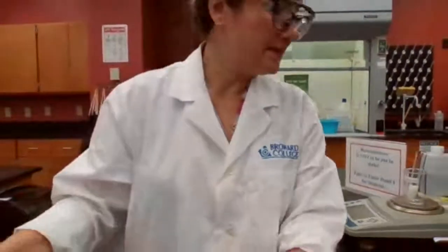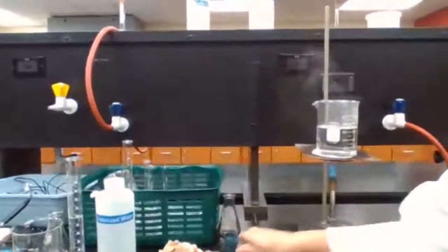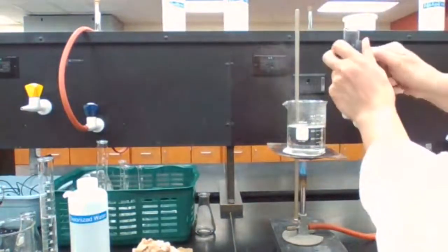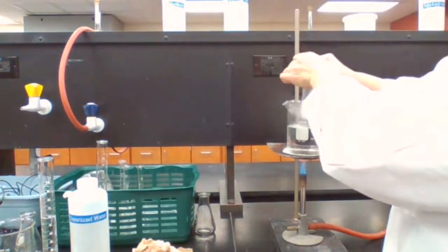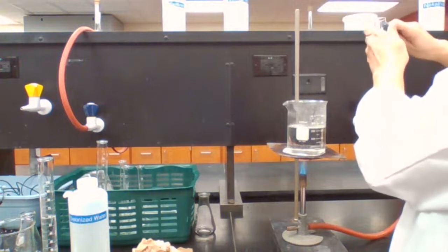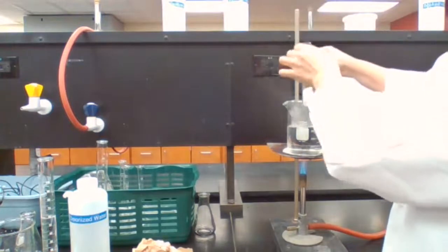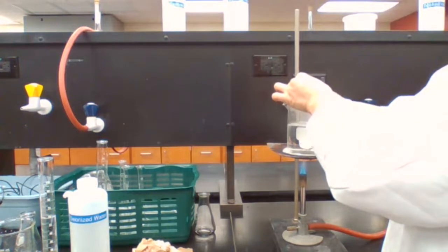Then we place the test tube in the hot water bath. We want to melt the benzophenone.